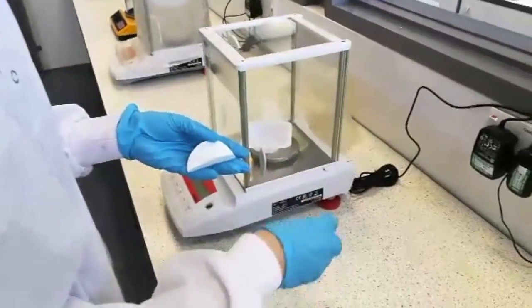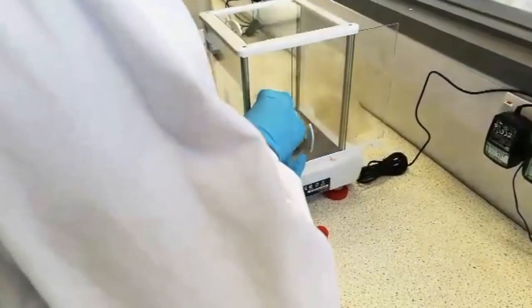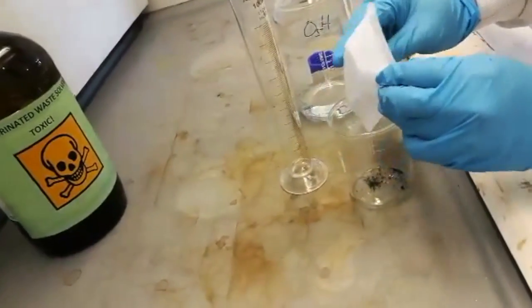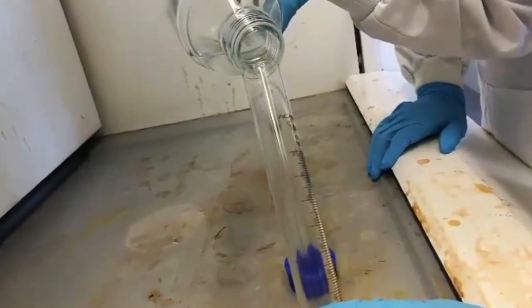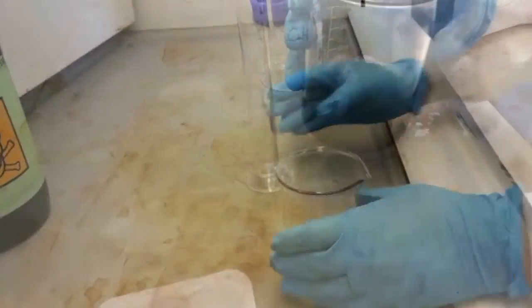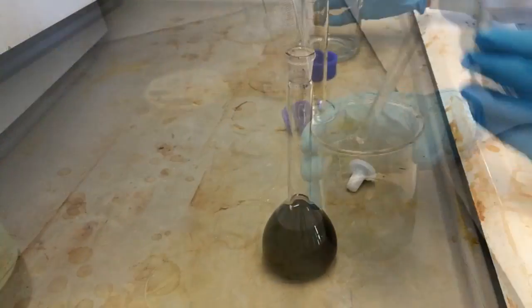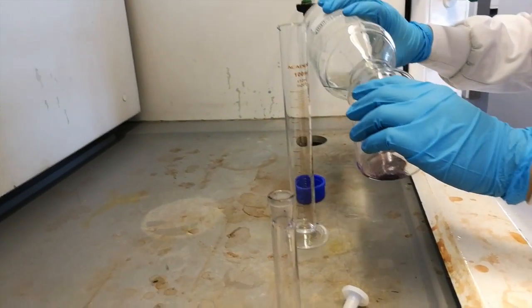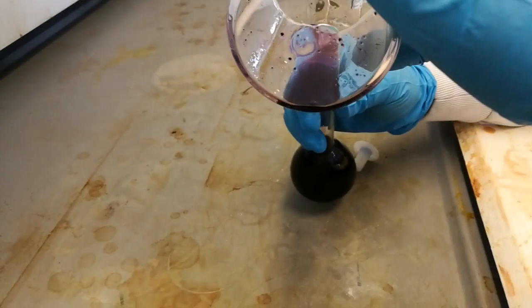We weighed DPPH powder to ensure the solution is saturated. Next, we made up the DPPH stock solution by dissolving the powder in ethanol. This was placed in a volumetric flask and was made up to 100 milliliters.